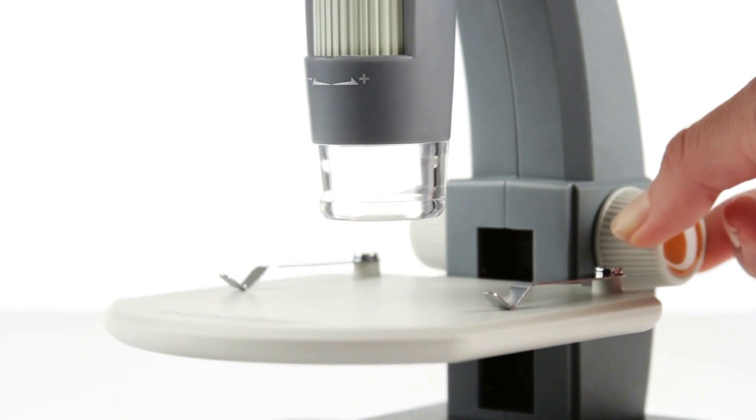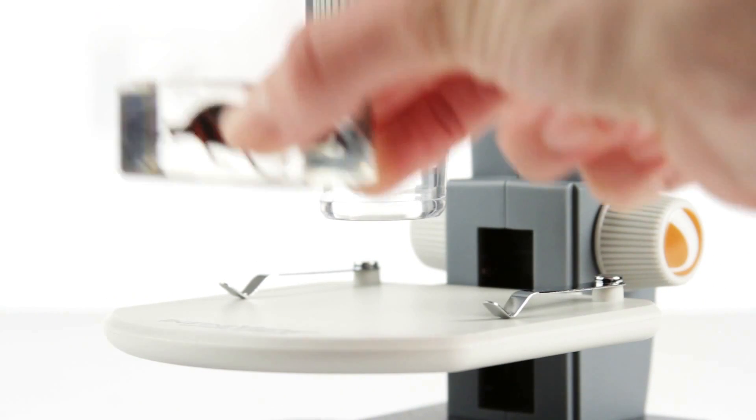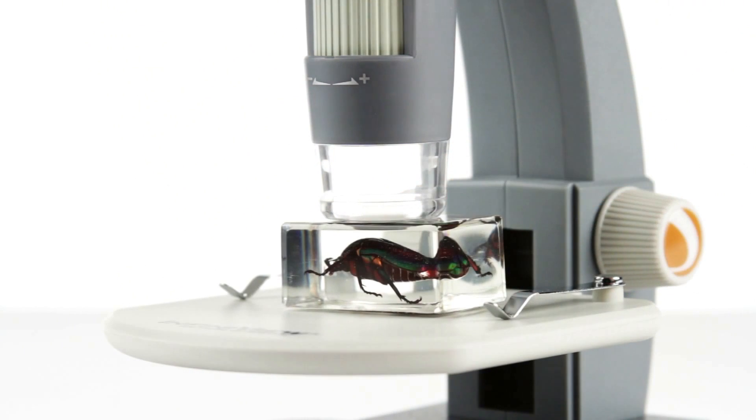InfiniVue is a customer favorite for examining 3D objects like insects, circuit boards, and forensic evidence.